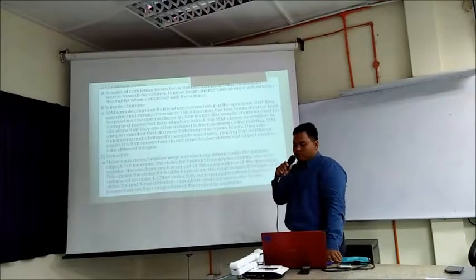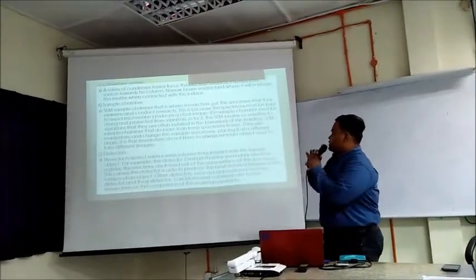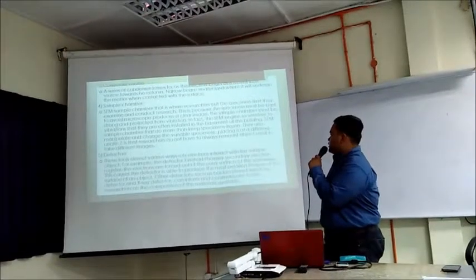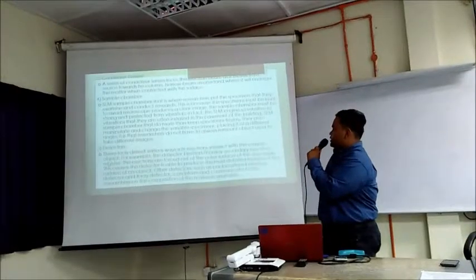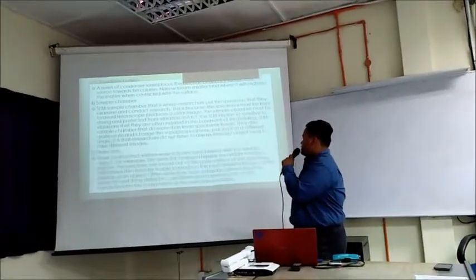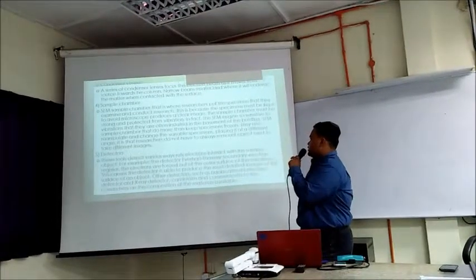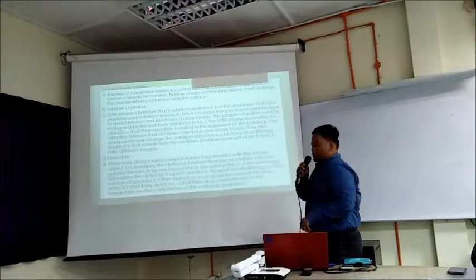Okay, number 5, detectors. These tools detect various ways in which electrons interact with the sample object. For example, the detector registers secondary electrons, which are electrons forced out of the outer surface of the specimen.